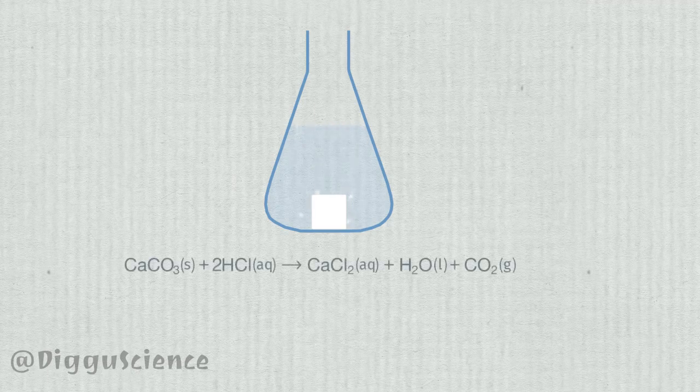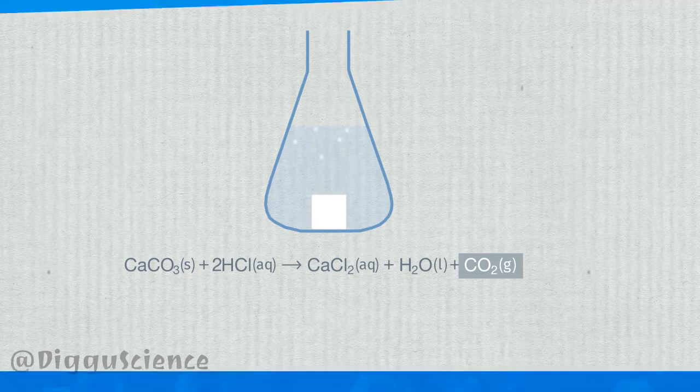From the chemical reaction equation, these bubbles are none other than carbon dioxide gas. Thus, the presence of bubbles in the tube indicates that a chemical reaction is taking place. Chemical reaction between calcium carbonate and hydrochloric acid.